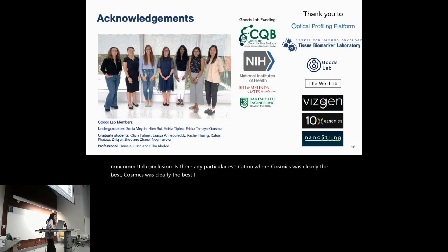I mean, yes, it has 1,000 genes. CosMx, right now, Xenium can only have up to 300-ish genes in its probe. But I want to also let everyone know that 10x claims that they're having this 1,000 gene panel coming out in half a year, probably end of 2024, start of 2025. So we'll see if that's the case. But right now, CosMx has up to a 1,000 gene panel, which is valuable. So, yeah, the short answer is yes, of course.